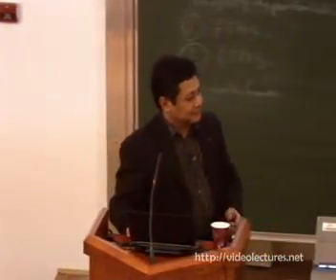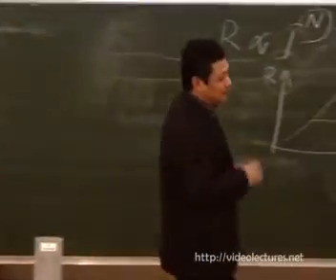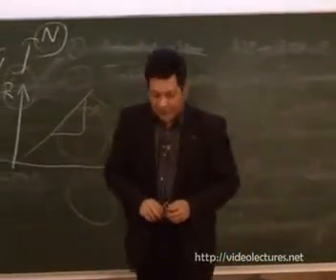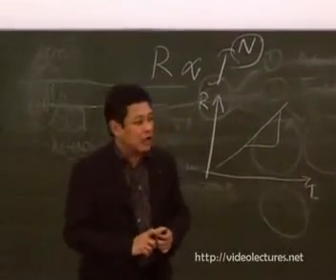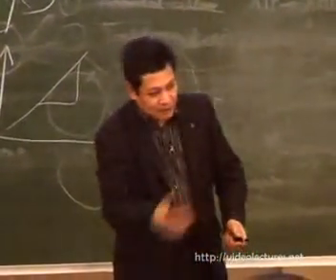So how do you really put spinach in your STM? All right, so the molecule is produced from the spinach. It's 97% purity, sorry. We bought it from Sigma Aldrich, yes. It took us almost a year to learn how to deposit these molecules. Of course, my students work for that. So just give them, encourage them.